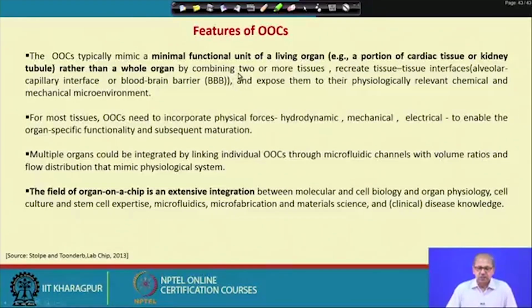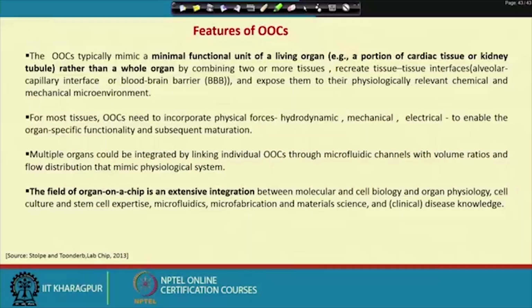And these compartments or tissues will be organized to recreate tissue-tissue interfaces like the alveolar capillary interface or blood brain barrier, and expose them to physiologically relevant chemical and mechanical environments like cyclic force or stretching force or fluid shear, etc. That is why, for the development of most organ on chips, they need some mechanical force, electrical force or optical induction for their maturation, and at the same time to exhibit their physiological behavior.